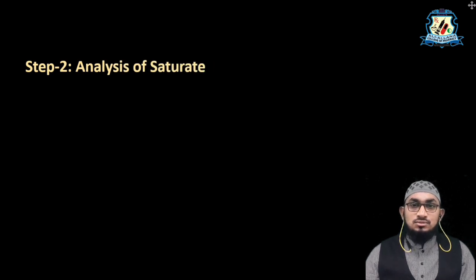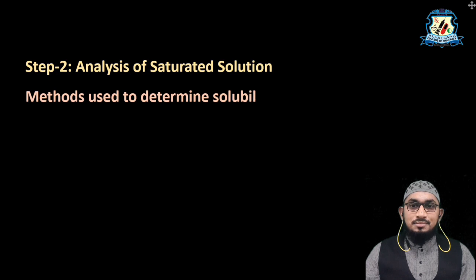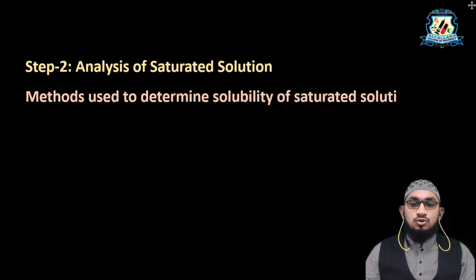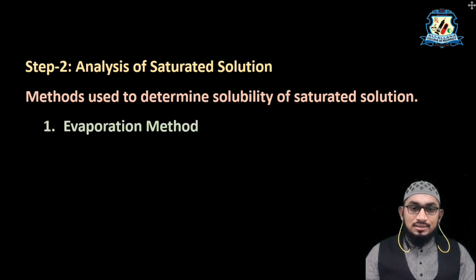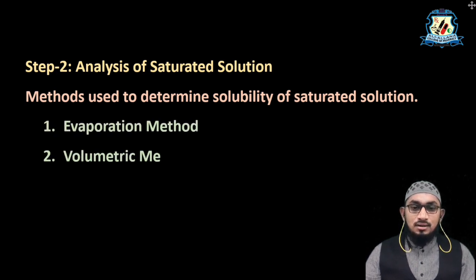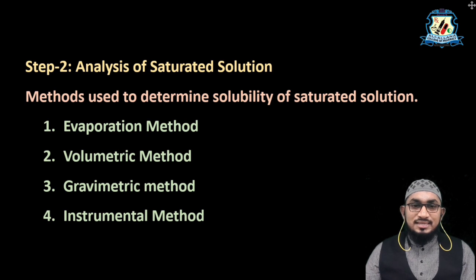In the second step, we will analyze our saturated solution. For that we can choose different methods which can be utilized to determine the solubility of saturated solutions. These are: first is the evaporation method, second is the volumetric method, third is the gravimetric method, and fourth is the instrumental method. Our today's experiment is based on the volumetric method.